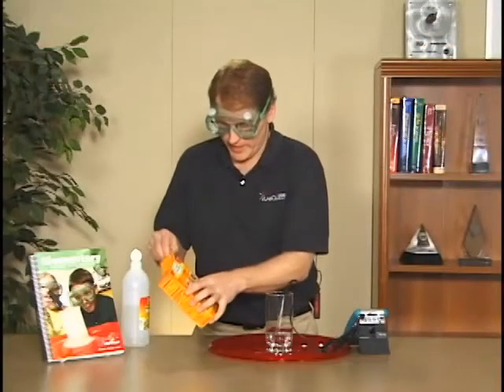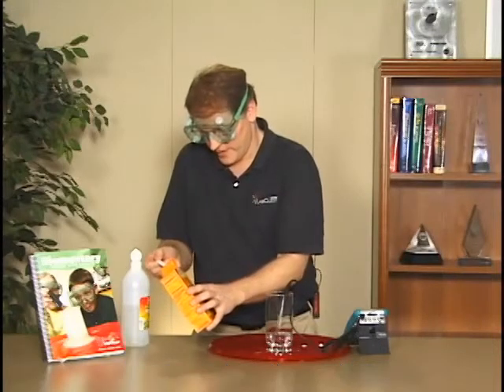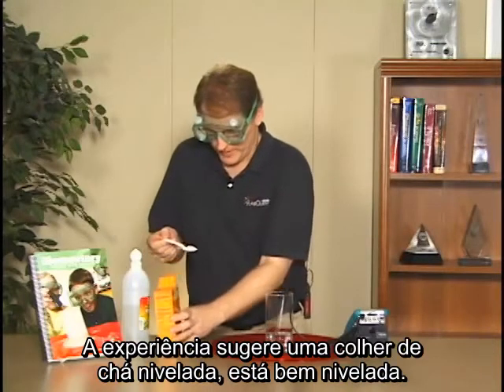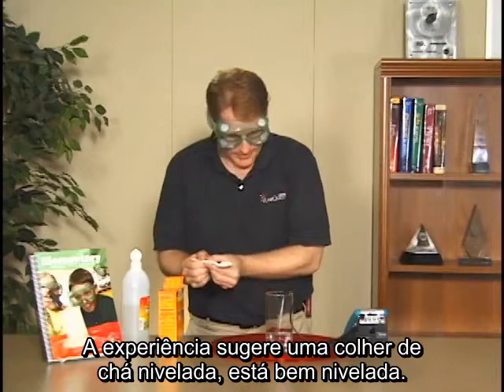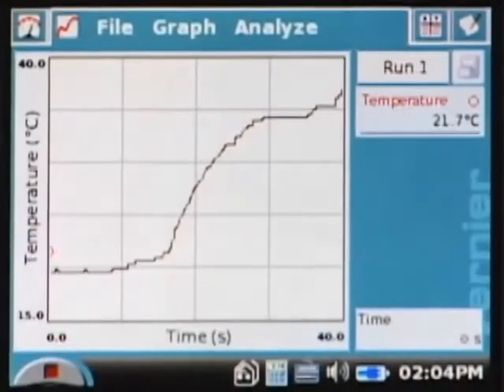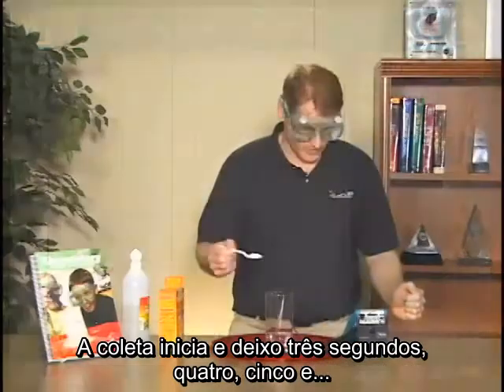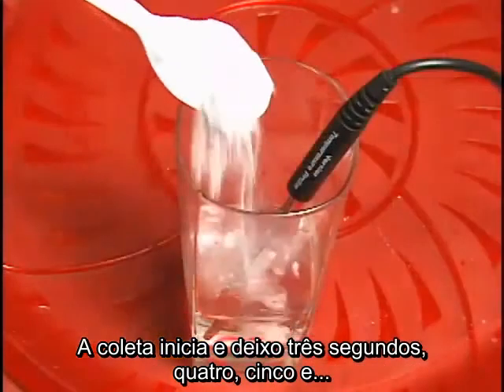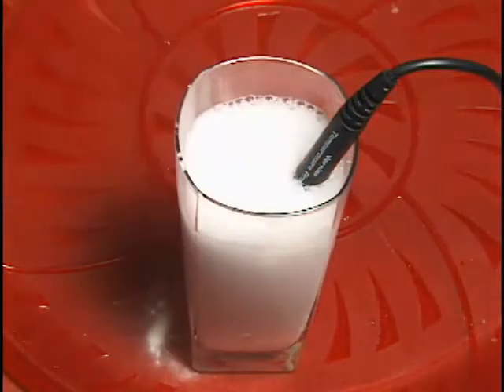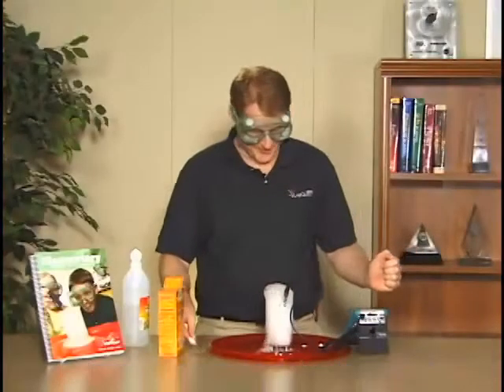So let me get some baking soda there. The lab calls for a level teaspoon. That's close to being level there. And so I start the collection. And it starts collecting, so 3 seconds, 4, 5, and you see now why I have the tray.